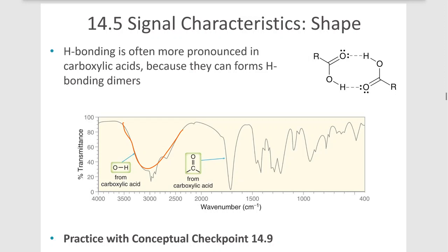Another thing to note about carboxylic acids is if you have a solid carboxylic acid, the signal will often be kind of jagged.